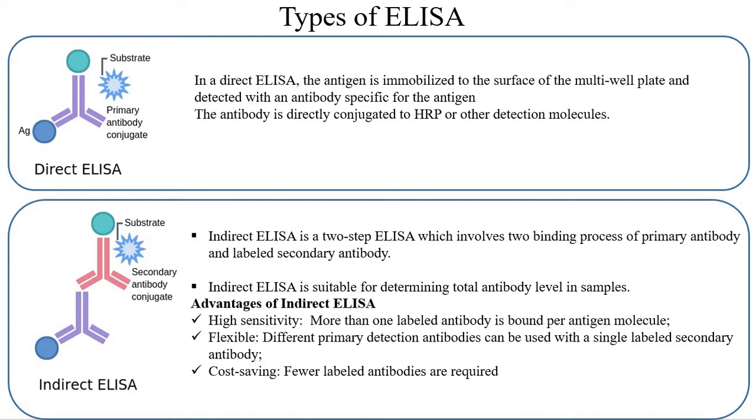The use of secondary or tertiary antibody for detection can lead to signal amplification, but also leads to a longer, more time consuming and more complex procedure.